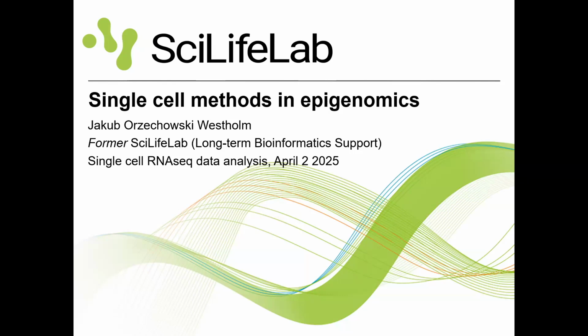Yeah. I think also there has been some work with doing these mini bulks, grouping several ATAC cells together to be able to analyze them together, because it's too sparse to have each cell as an individual. Yeah. So when you do these comparisons, you have to do them between groups, and they have to be quite big groups. If you want to look at differences, you can't just compare 5 cells to 5 cells. It's not going to be good.